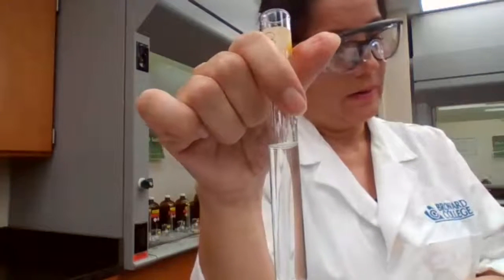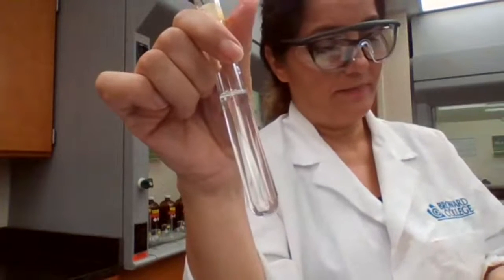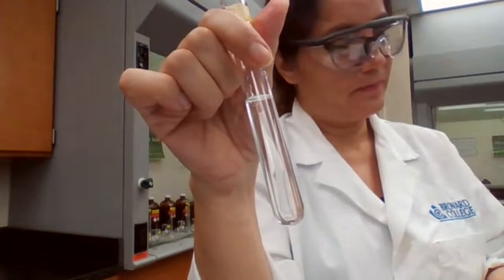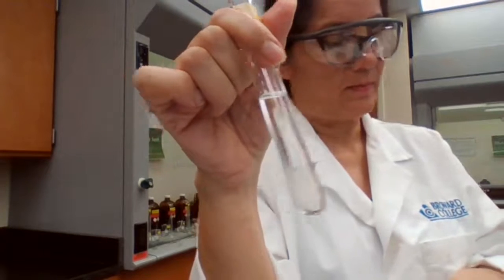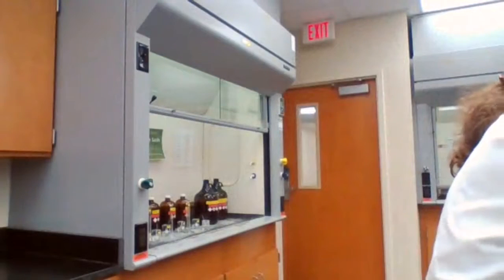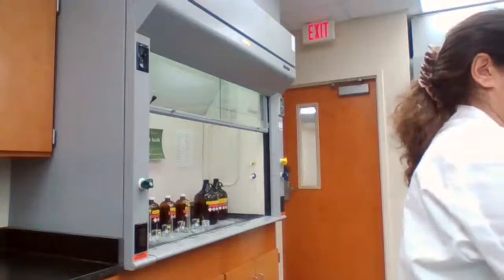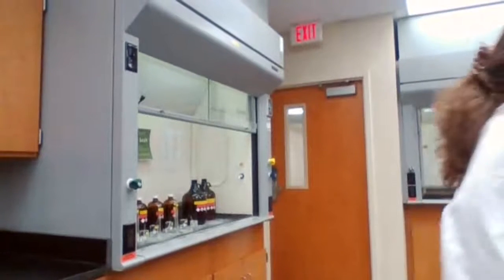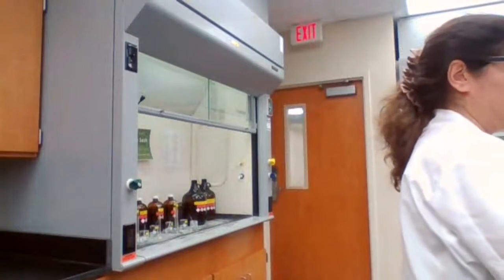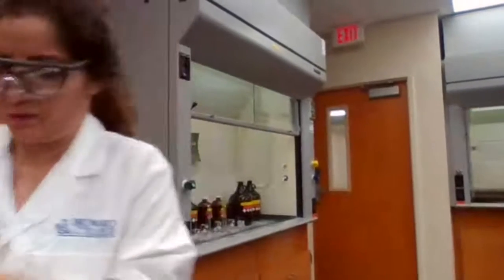And we are going to add sulfuric acid to this solution. Going to label so we know which one is which. Label a test tube for acid and one for base.